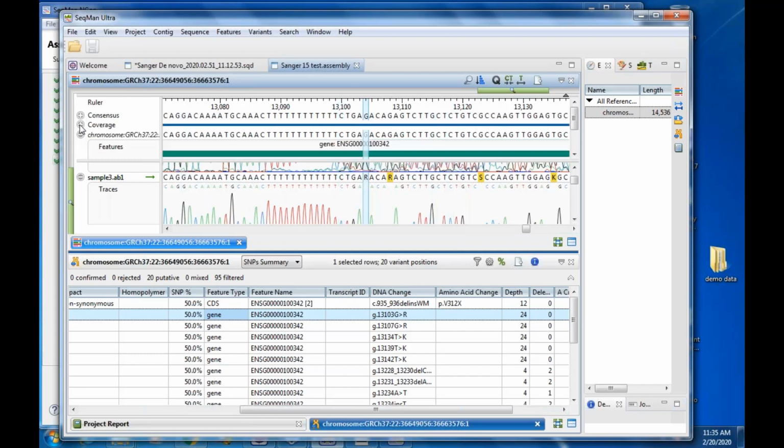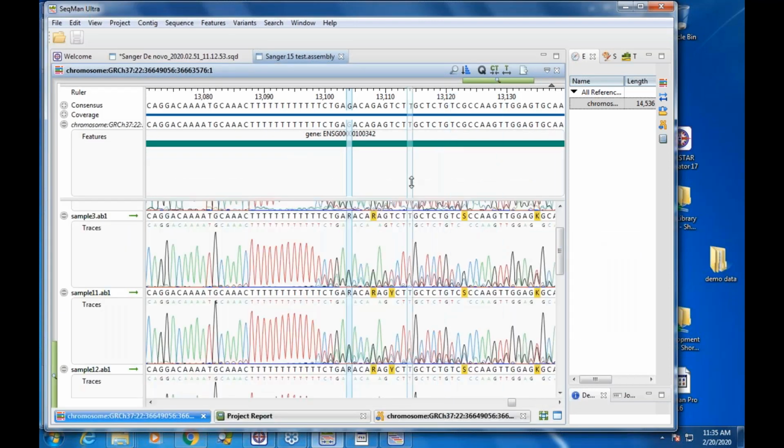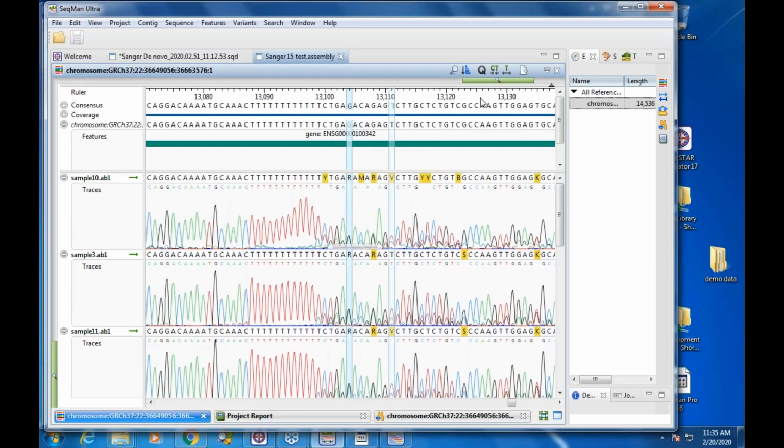So I can collapse things down as we get crowded here, especially at this low resolution. These buttons in the bottom right are really useful. So I can make this a single view and keep adjusting this view as needed, right? So I can also detach a view.